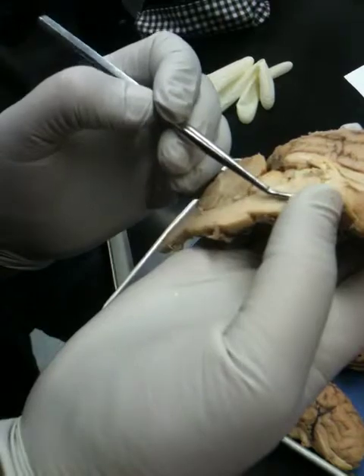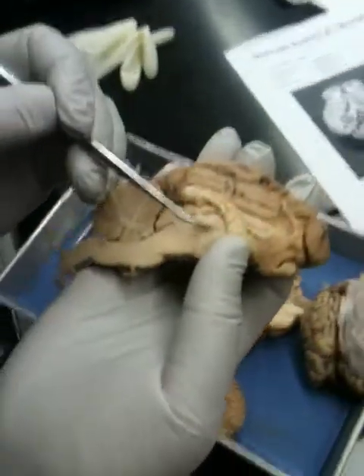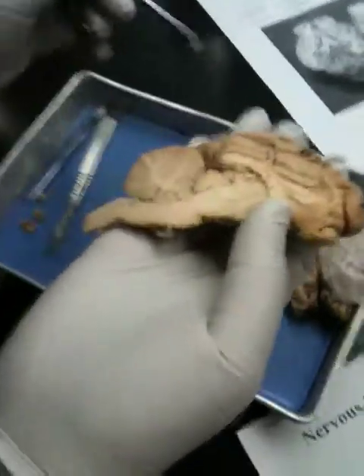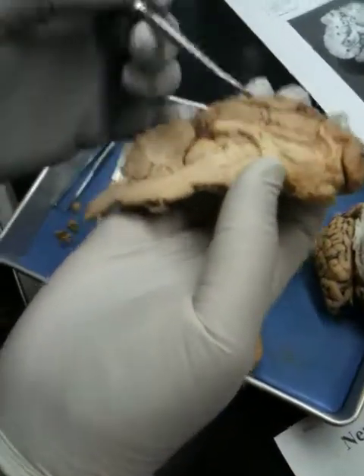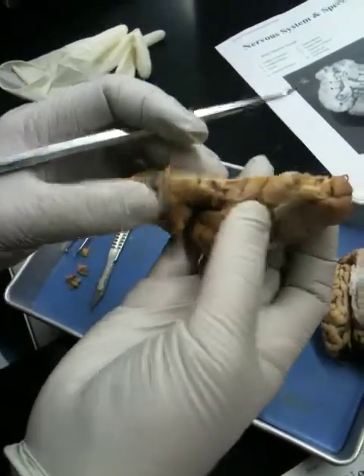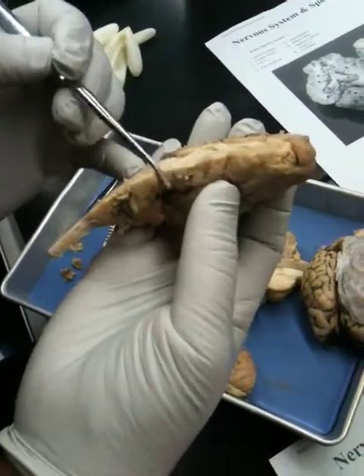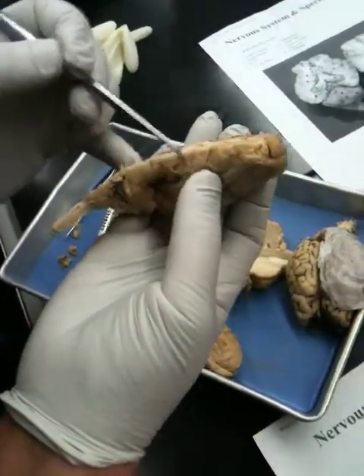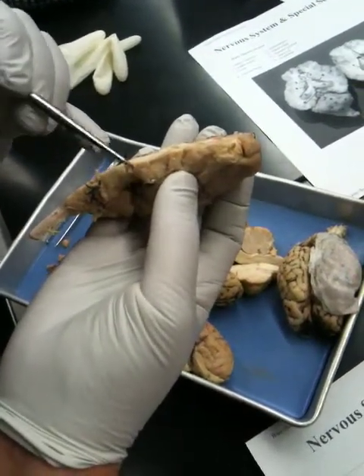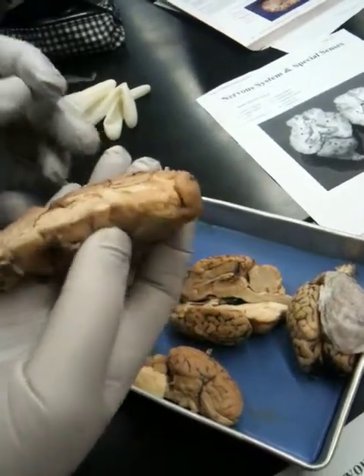This right here is the thalamus. In the very middle you kind of see this region that's been chewed up — that's the intermediate mass of the thalamus. Right below the thalamus is the hypothalamus, and you should be able to see the optic chiasma there. And if you had the pituitary, it would be right here connected via the infundibulum to the hypothalamus.